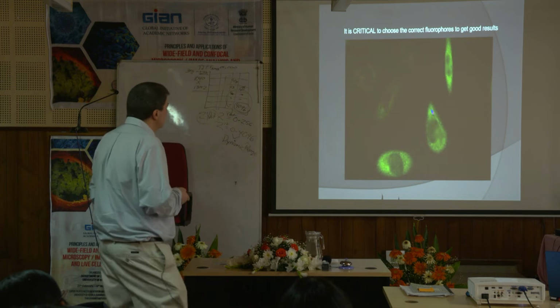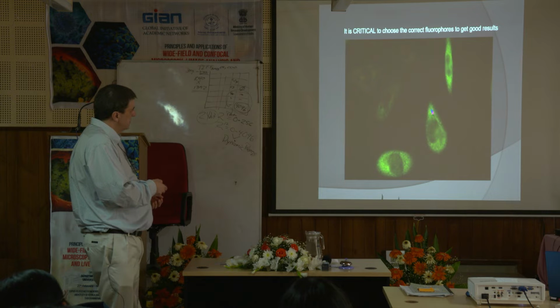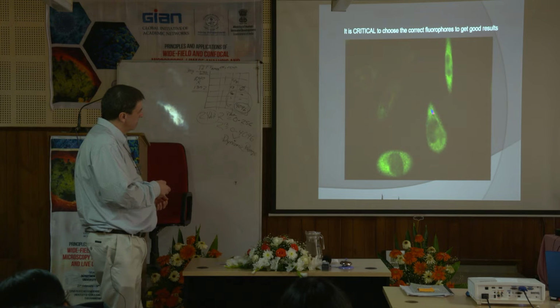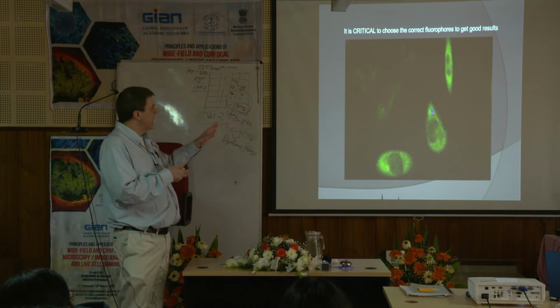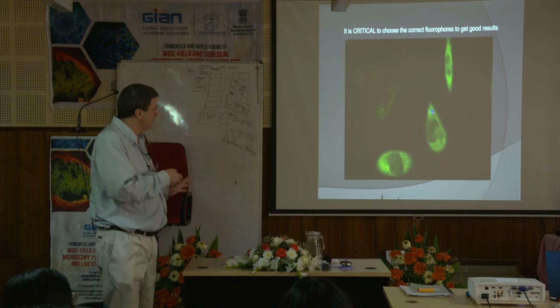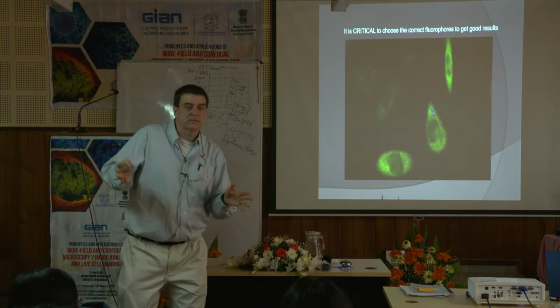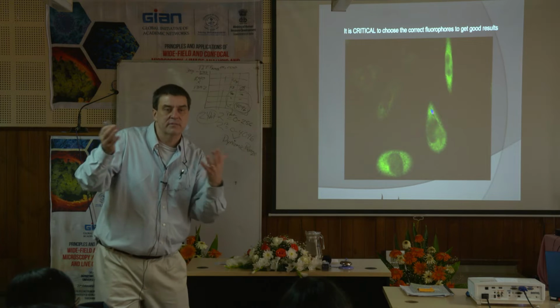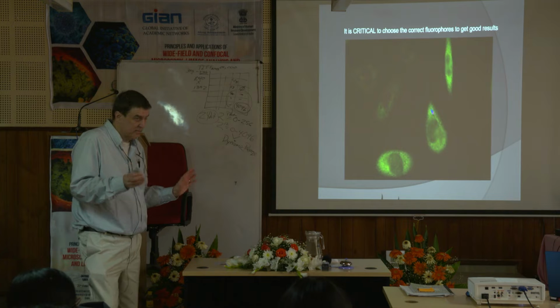Okay. So what they do in that lab is they look at autophagy, and then they use a different color here to look at the parasite, and then we're looking at a protein that showed where the parasite interacts with the cell. So this was 3-color imaging we did with green, blue, and red. Okay. And again, I don't know if the blue was blue, but it's pseudo-color. I think it might actually have been a far red dye, but we made it blue just so we could see it better. Because remember, they're not colors. They're fake. You just are applying colors to make it look the way you want. Because it's just photons. Everything's photons. Everything's math.